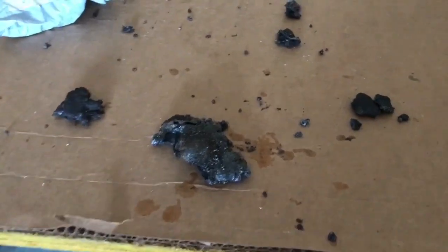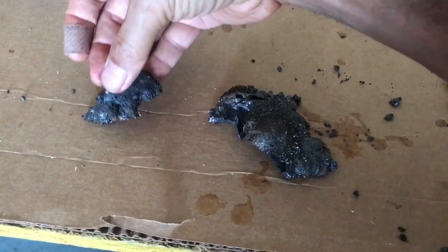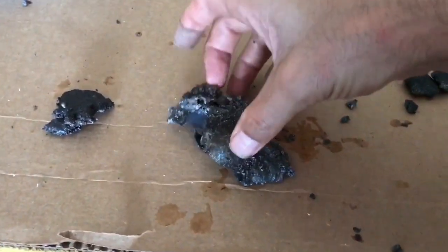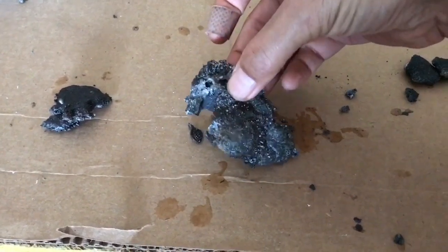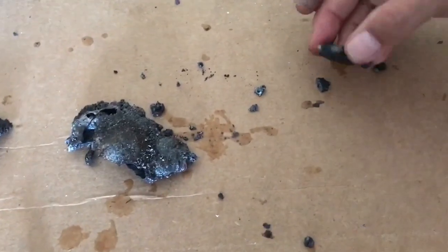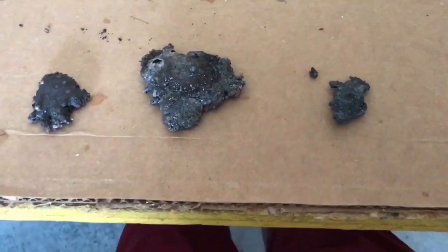So we have our products from the different thermite reactions that were run. This one was quenched with liquid nitrogen. This one was run on a larger scale, so you've got more product, and was quenched with cold water. And this one was allowed to cool down in air slowly.